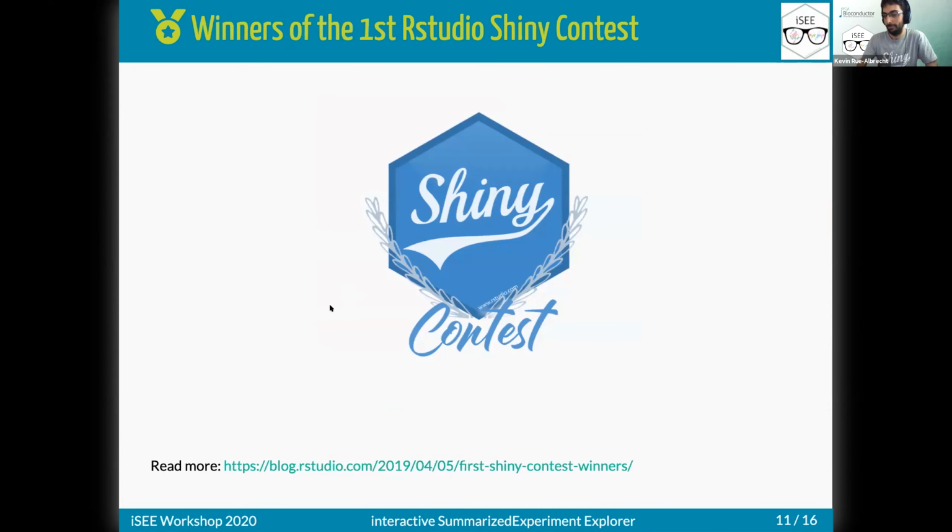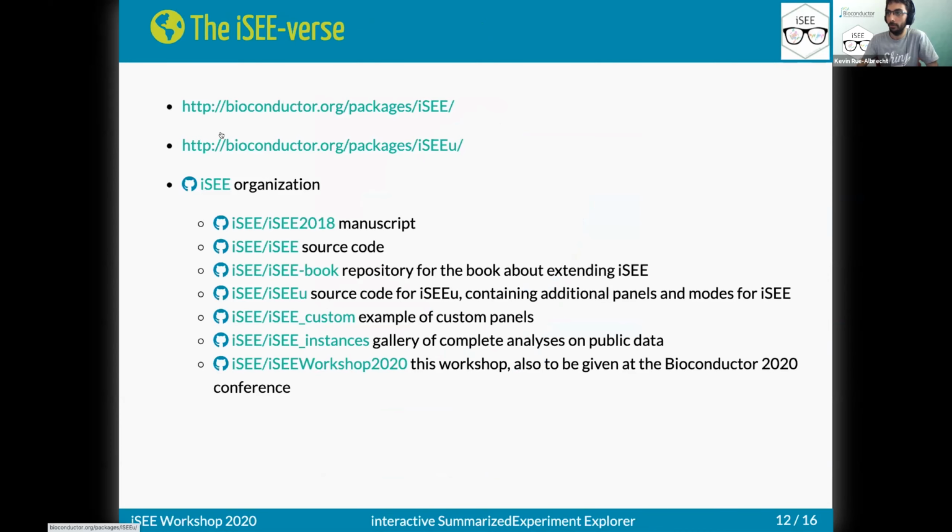And again, I'll just mention that iSEE won the first Shiny contest, for best technical submission. So this is how much effort we put into it. And we have this slide, so again, you'll find it on our GitHub repository with all the resources that come with iSEE: the different packages, the manuscript, and a book to learn more about it. We can't fit it into vignettes anymore.